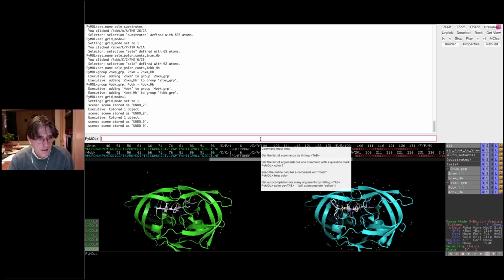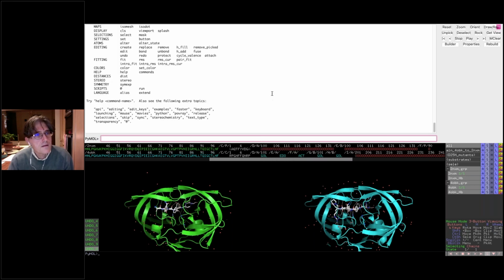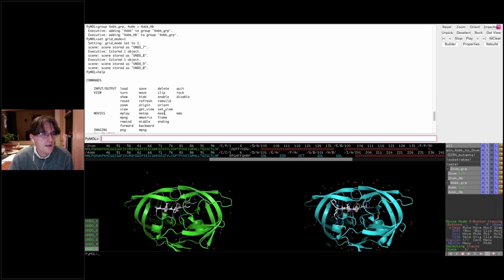Let's see. I wanted to show you help. So if you're ever curious, you can just type help if you don't know how a command works. So help, and then these are all the things that it can help you with.